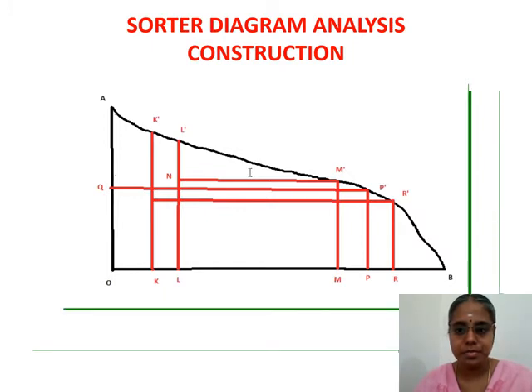Now we are going to analyze this sorter diagram. I have not given the notation.